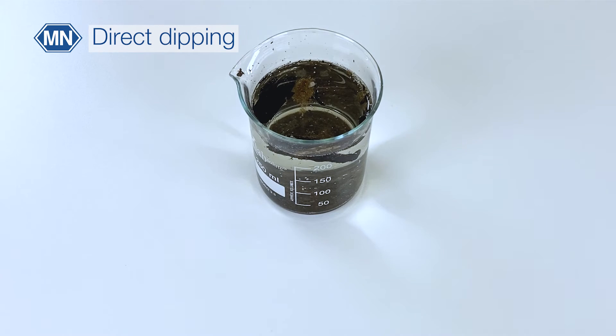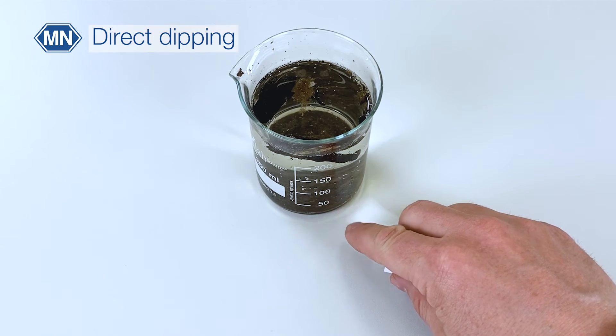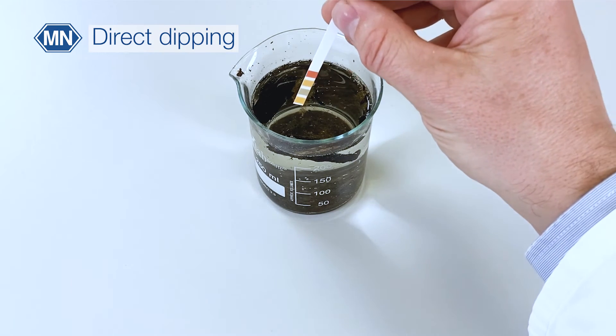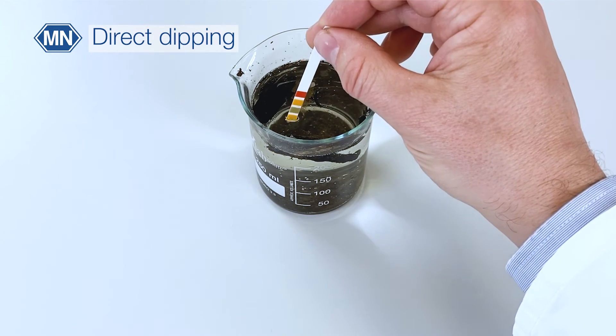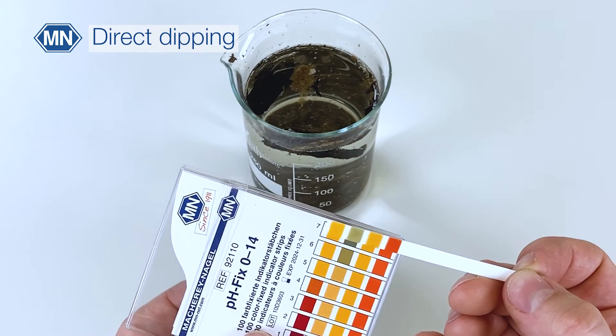So in this situation, the best practice is to let the sample settle down, then take a test strip and dip it into the sample. When you do that, try to remove as little particles as possible, and then compare to the color chart and read off the result.